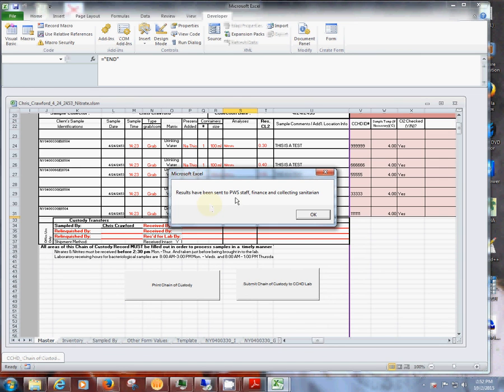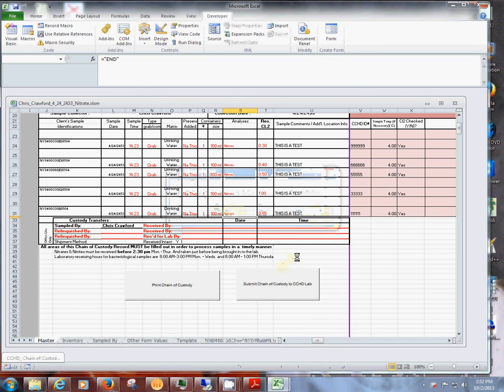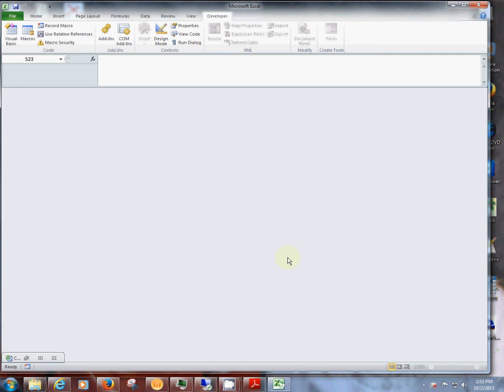And then that's that final email that you guys are currently getting, and it's on its way. And sure, I'll save. That's it. That's the changes. I will tell you I have tried to test all of this. I will also tell you I was bound to make mistakes. So this looks pretty good right now, and hopefully it will work fine.